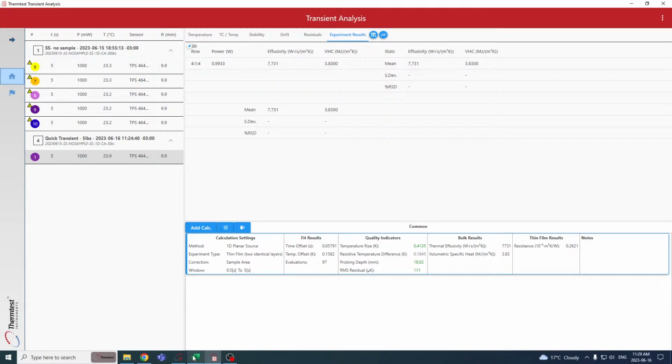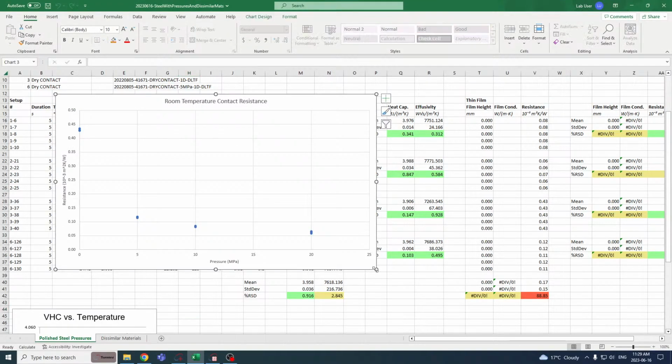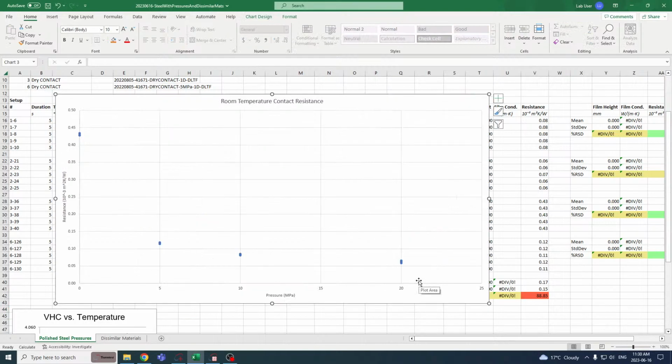But we have a couple other examples to show, as I had previously mentioned. So this is stainless steel, polished against polished, so the exact same pieces, just polished on both sides. Obviously where it's polished, you can see right away that, compared to one of those measurements we just made, which was 5 pounds, this is a much lower thermal resistance because that's polished against polished, not polished against sandblasted or rough. So you do have a lower resistance due to that very phenomenon.